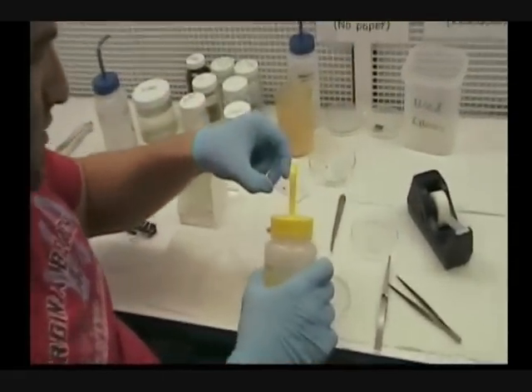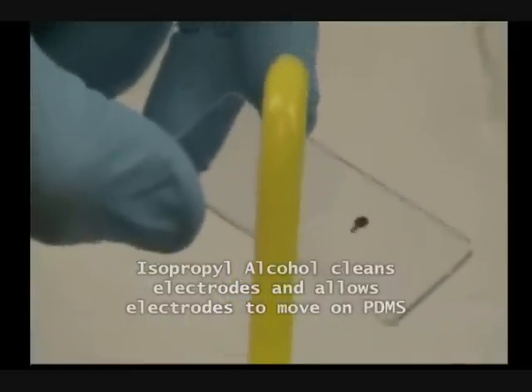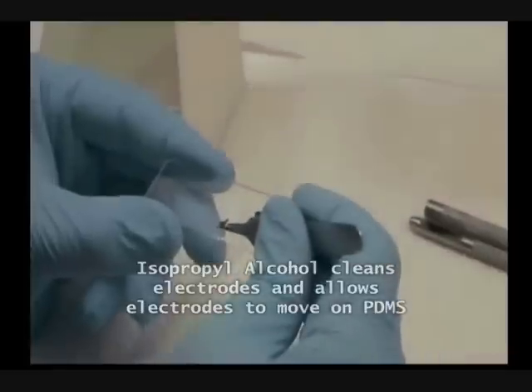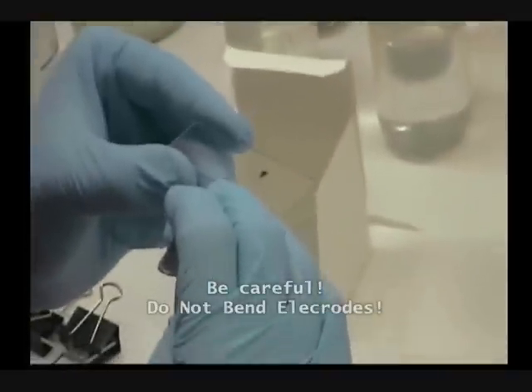So I'm gonna put a little alcohol here to make them cleaner. And with this alcohol I can move the electrodes on PDMS. Otherwise it is really hard to move them. And we need to be very careful not to damage the electrodes.